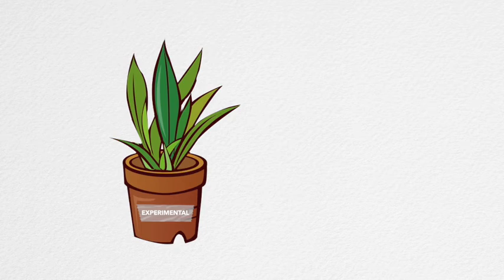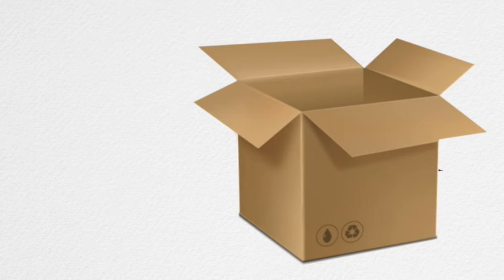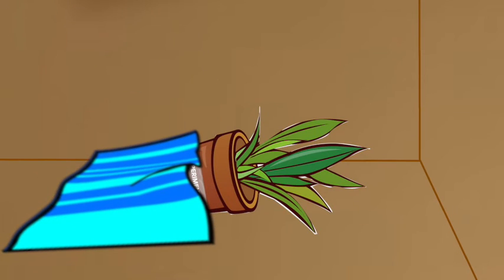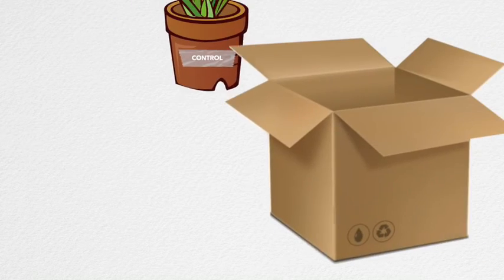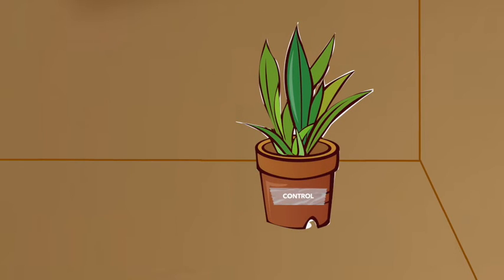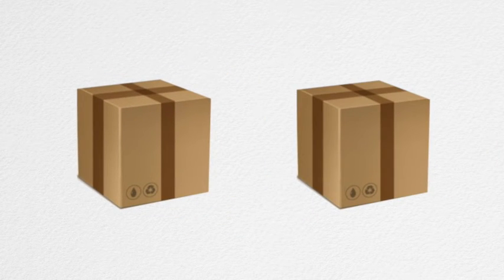2. Place the experimental plant on its side inside the box and put a piece of cloth around the pot to limit the pot from moving around. Then take the control plant and place it right side up inside the box. 3. Close the boxes and secure each box with tape. Then cover each box with a piece of cloth.